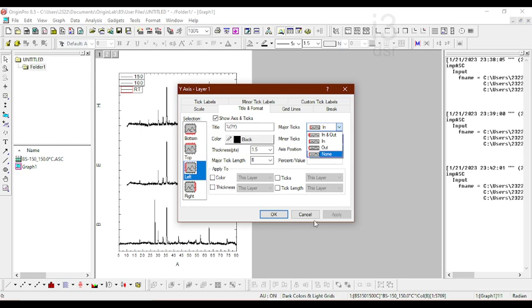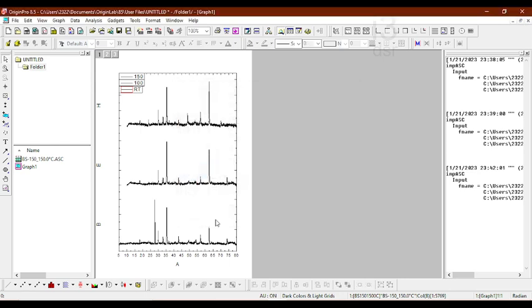I'll just say how I did it again. You must remember this is one graph, this is the second graph, and this is the third graph. Every graph is independent. That's why we have to delete it three or four times. Even this hatch has to be deleted. I'm going to delete it. We will work on the legends later. Initially I'll just clear the border.